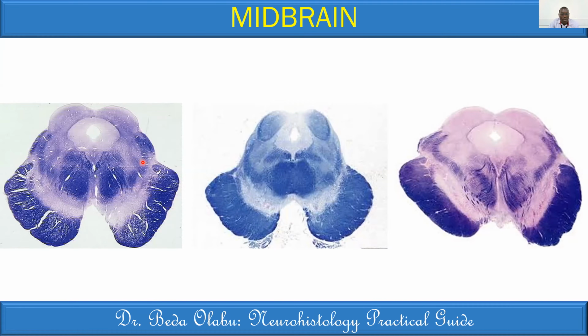So for midbrain histology, the things that Dr. has mentioned are very correct. The aqueduct, periaqueductal gray matter. Whenever you see this characteristic shape, boxer shape, it becomes very characteristic for the midbrain. And then now we mention a number of things. So this is the tectal plate. It could be superior colliculi or the inferior colliculi level.